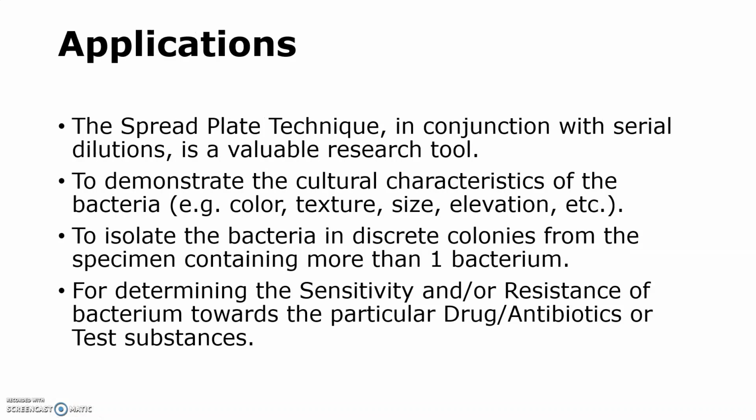Now next is the application. The spread plate technique in conjunction with serial dilution is a valuable research tool and it helps in demonstrating the cultural characteristics of the bacteria, for example, color of the bacterial colony, texture, size, elevation, etc. of the colony can be demonstrated.